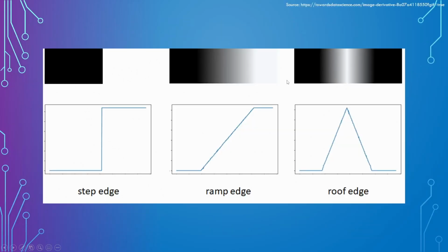And if I show you this example here, where on the very left-hand side we have a dark pixel and a light pixel, we can see that this transition, or slope, is very large versus something a little bit more gradual, with the gradient here going from dark to light. The slope is not as steep. So we can characterize sharpness and blurriness by the size of the slope, or the size of the difference between pixels.